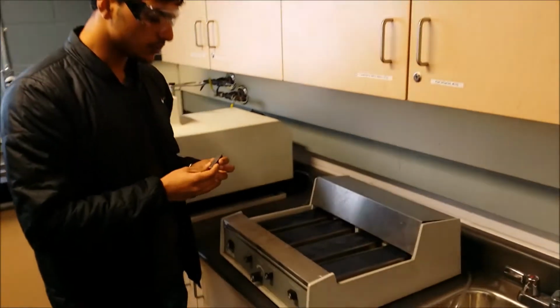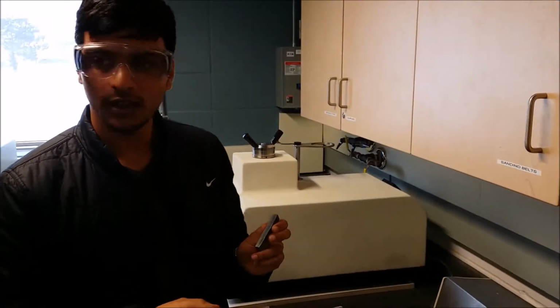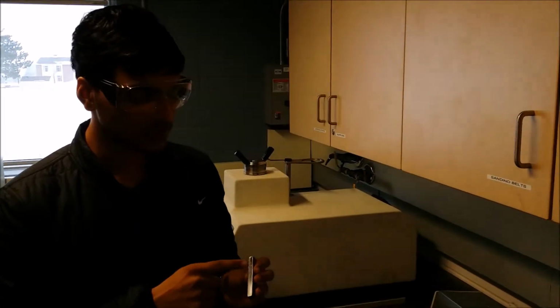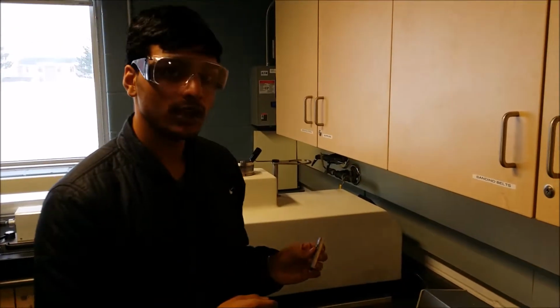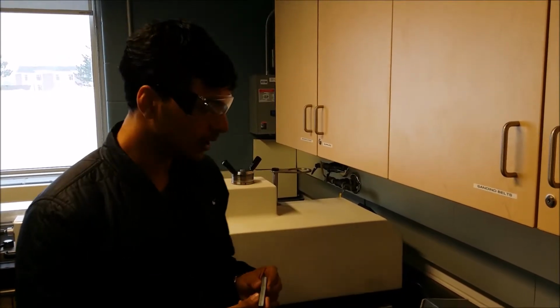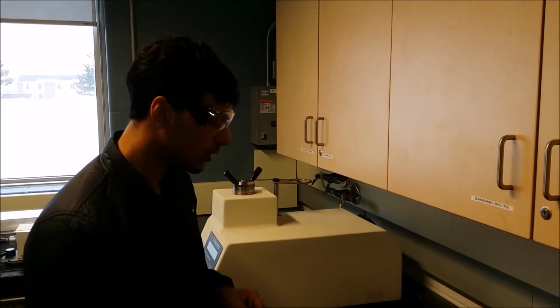So the main purpose of this polishing is to remove all the debris from the surface so that we can have a good image at the microscope. After polishing and grinding, the sample will have a mirror finish so that it can reflect the light to a greater extent, and we can have a good view of the microstructure of the sample.